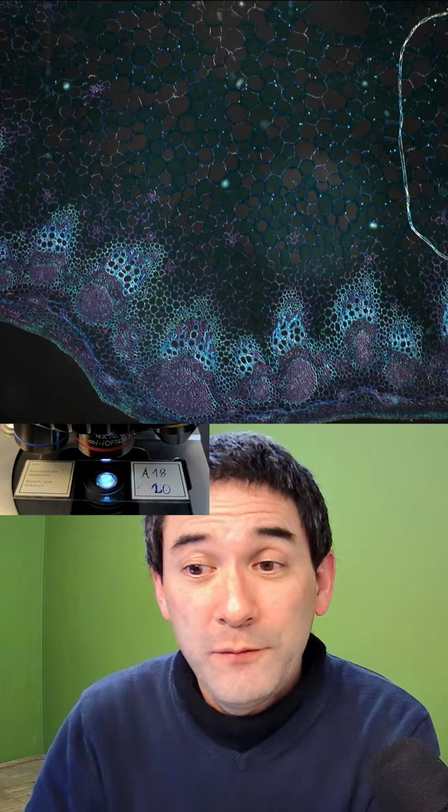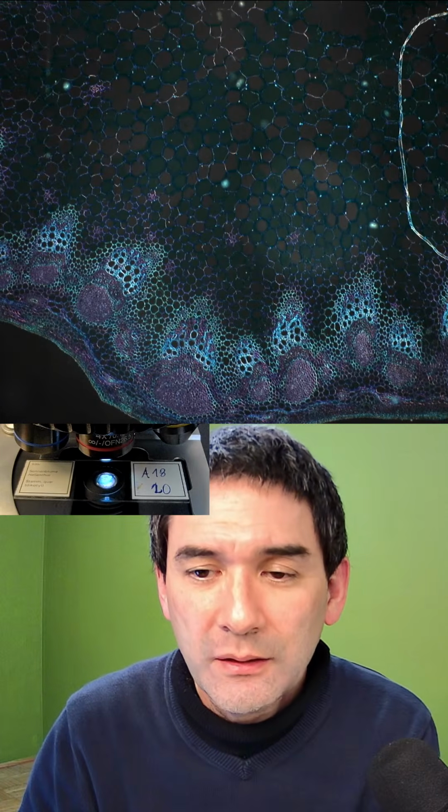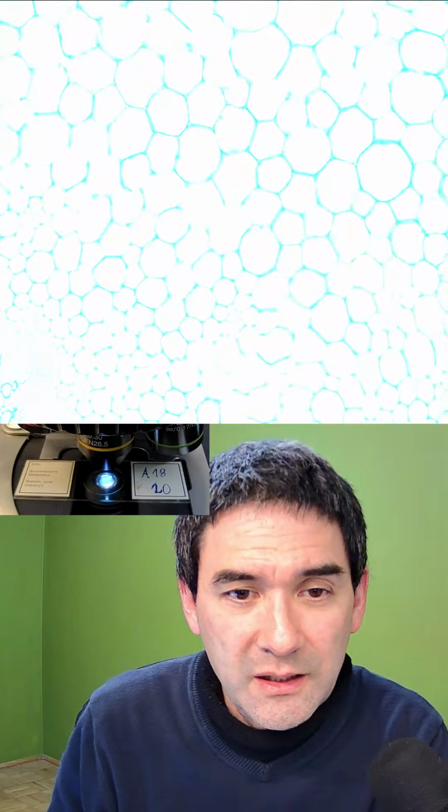Okay. If you have any green, yellow, or red paper wrapped ones, please quarantine them and handle with gloves. The pigments may contain arsenic. I would like to have a little more info on that. Does this mean that they have actually used arsenic to make the red color? Or did they use arsenic to preserve the paper? I would like to know a little bit more about this, because indeed, I do have slides that are red. So, the arsenic for green.